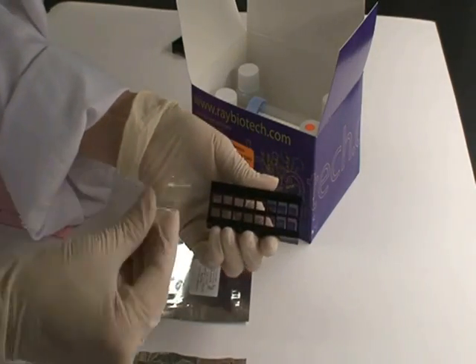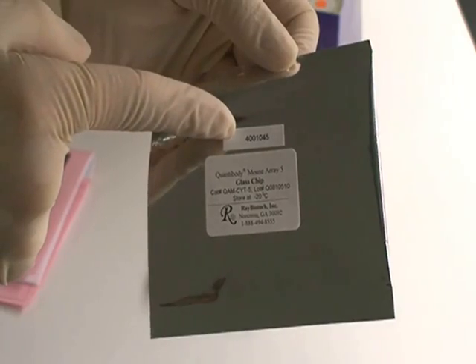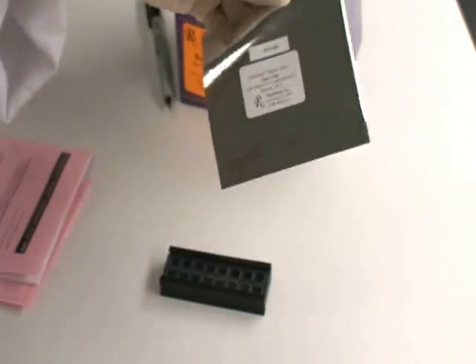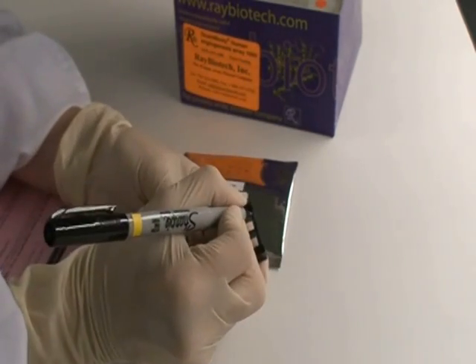Before discarding the slide bag, be sure to write the serial number from the bag on the back of the slide using a permanent marker. This will help you easily distinguish one slide from another. Be sure to write the number on the very edge of the slide.